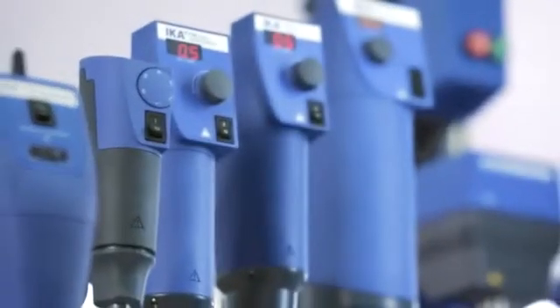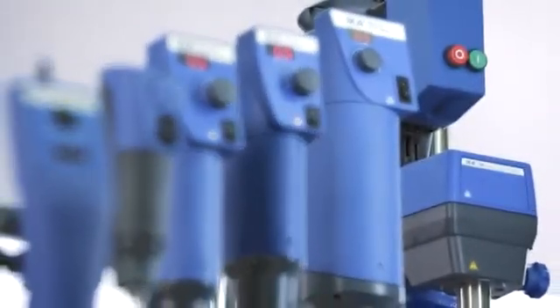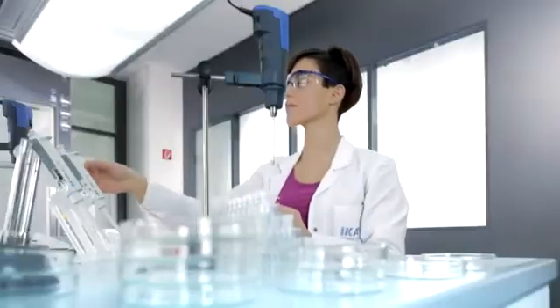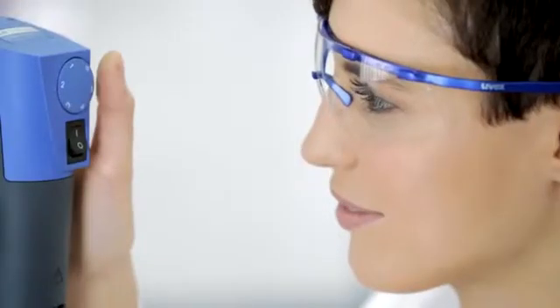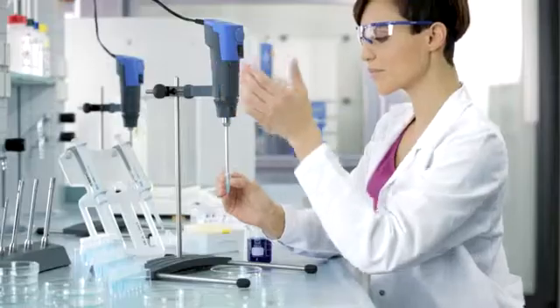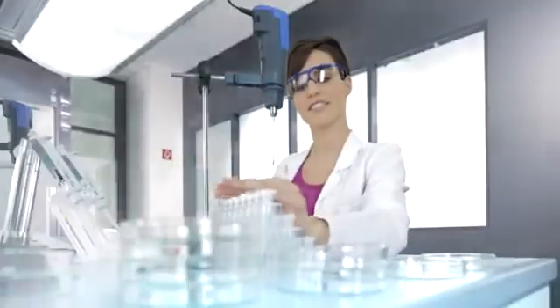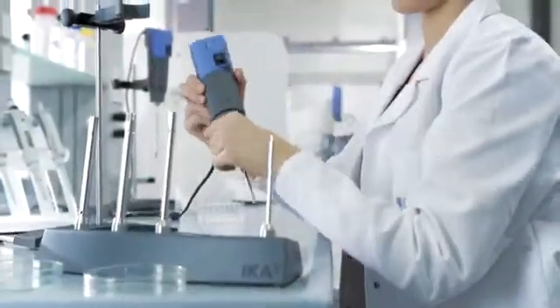The innovative T10 basic, small scale dispersing system for analytical research. Infinitely variable speed control, wide selection of dispersing tools, quick-release coupling, all in a lightweight compact design.